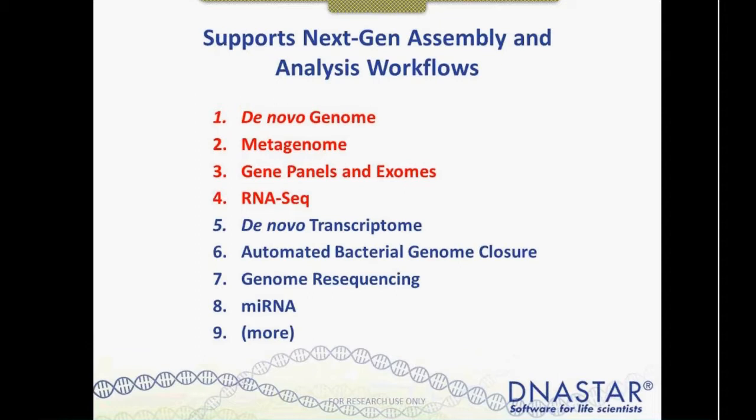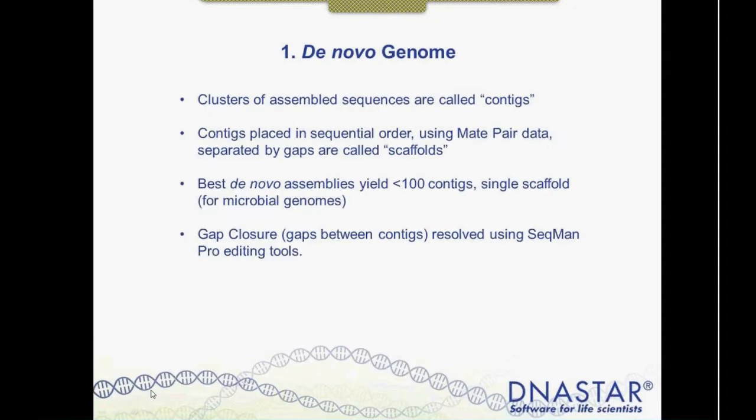There are some other workflows here: de novo transcriptome, automated genome closure, genome resequencing, and short RNAs. If you're interested in those topics, we have webinars recorded on each one of those topics. So you can go back in our archives and watch whole hour-long webinars just on one topic. So, again, this is going to be a little bit more of an overview. So we're going to start with de novo genome.